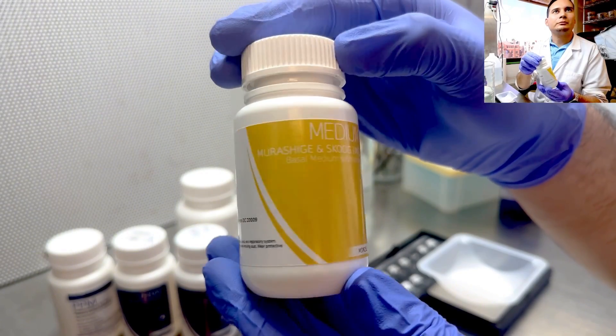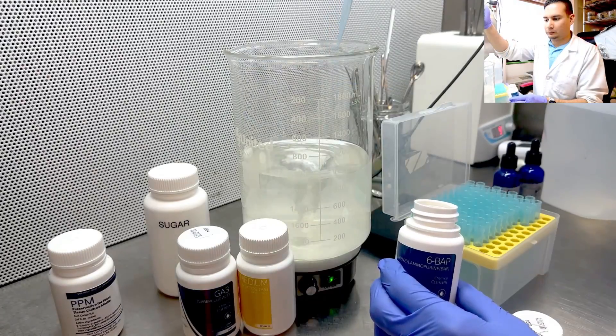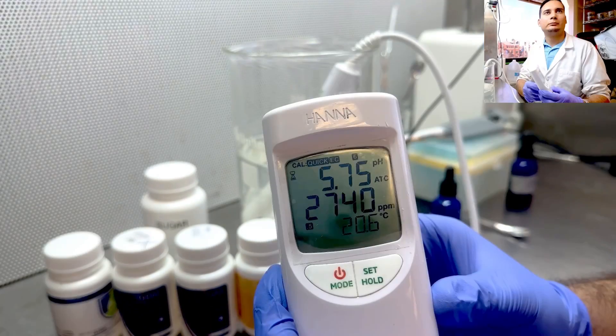Making tissue culture media. Let's start with the basics: making the media. You can buy pre-made powder from Plant Cell Technology. Simply mix it with water, add sugar, hormones, and PPM, then adjust the pH between 5.6 and 5.8. This is crucial because the right pH helps your plants grow properly and is your foundation for growing plants in tissue culture.